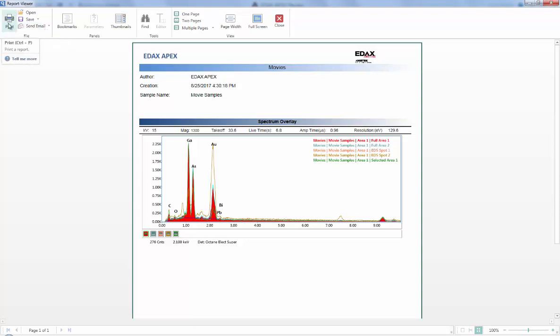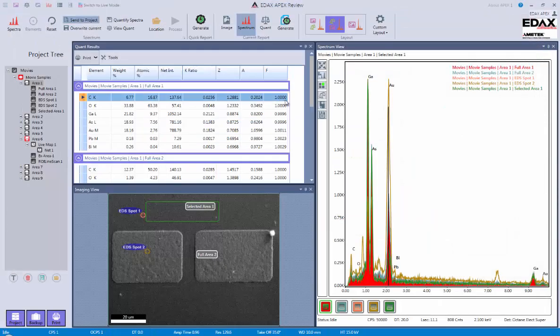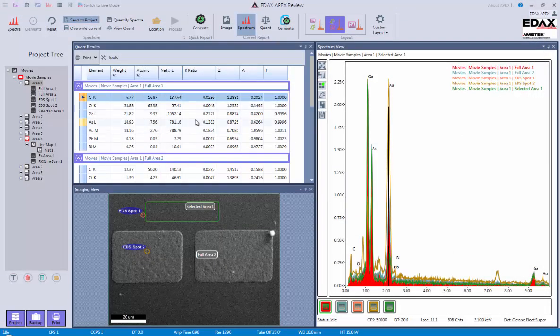And of course there's always the print button. So whenever I'm done with this, I can just say okay, I can save it, I can send it, and be done with it. And that kind of wraps up our quick review for the reporting functions.